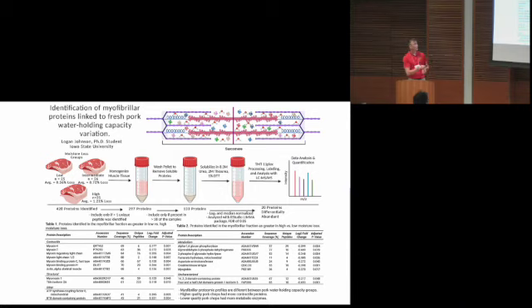I depicted that here as well. Low means it lost a low amount of its weight to water, or purge, of the kind you might sometimes see in a package, and a higher group lost a greater proportion of its weight in water. We're really trying to understand what's different about the muscle tissue between those samples. To do that, we fractionated our proteins, and we think this is advantageous to our analysis. We can separate the soluble and insoluble proteins, the sarcoplasmic or soluble proteins versus the insoluble pellet.